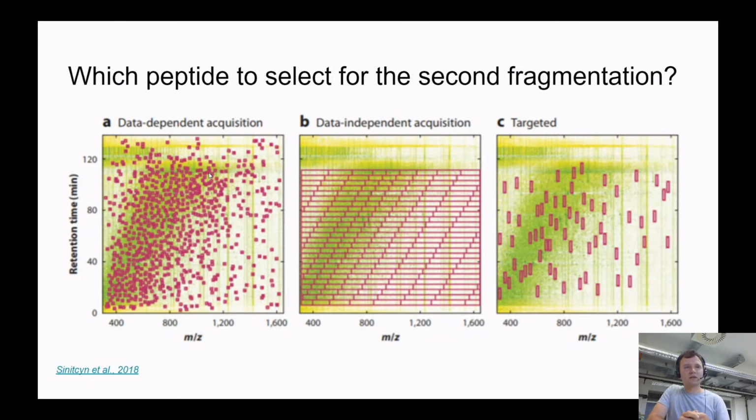The truth is that in some cases, we're going to have a situation when some peptide on day 1 was selected for fragmentation and for the additional measurement, and on day 2 it was not measured. And let's say the reason is because today it was top 19 and tomorrow it was top 21, and that's why today it was measured and tomorrow it was not. And this is a bit annoying, because as a result we are going to have this issue of missing values. We see the identification today, but we don't see the identification tomorrow.